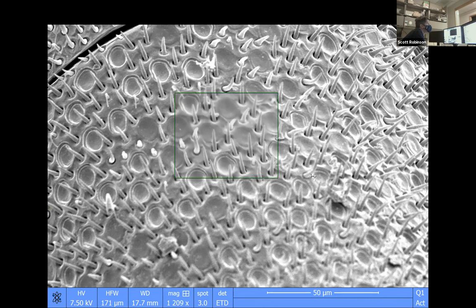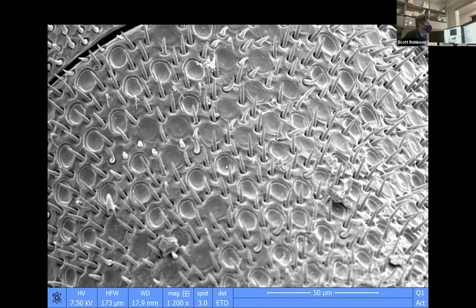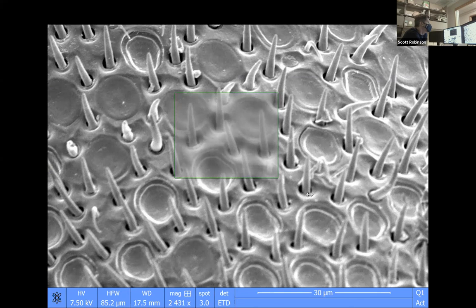Whoa. Is this the eye we're looking at? This is the antenna of that little bee. And so we can see these sensory structures on it. There are many different kinds of sensory structures. Each of these little setae that's sticking up out of here has a function. It's sort of like tasting the wind. Some of them can tell how wet the atmosphere is. Some of them can smell.